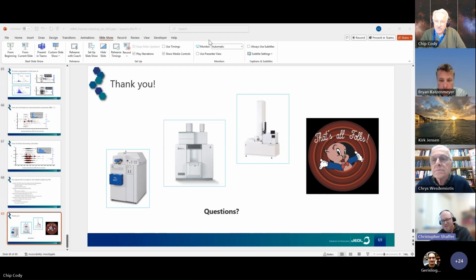And then finally on that one, I know that I've asked already, are you benchmarking against other things? But another factor or analytical technique for looking at degree of oxidative stress is sometimes IR. Did you do any benchmarking on that? We don't really have it here, unfortunately. We've got electron microscopes and NMR and mass spec, but no IR. But I used to work at Nicolet, so it would have been interesting to see what it looks like.